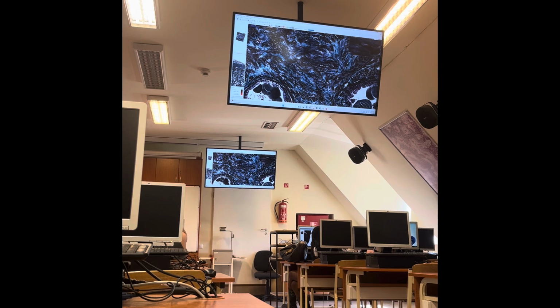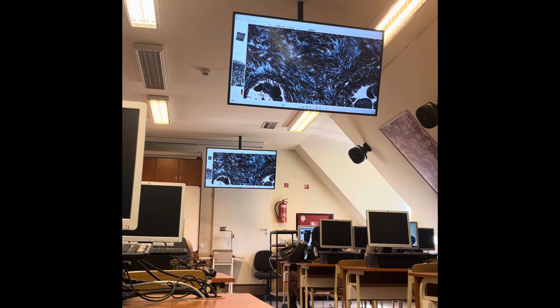But it's different kinds of dyes. When you go to pathology, histopathology, you will learn more trichrome stainings. So you will see more of these types of stainings when at least three structures are differently stained by different colors. Okay. Do we have any elastic fibers, or is it just collagen?